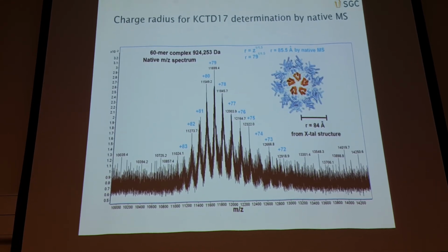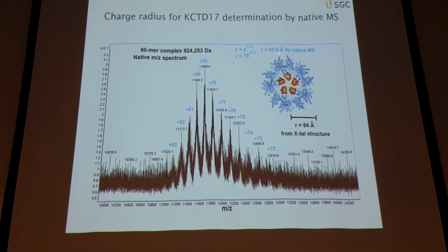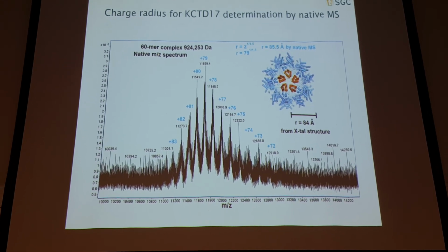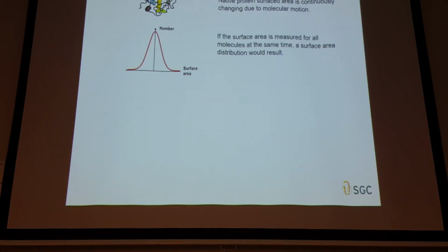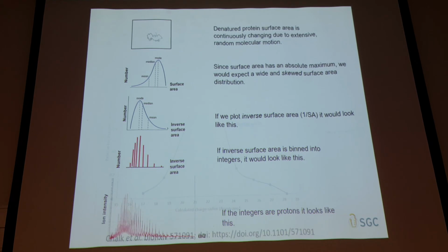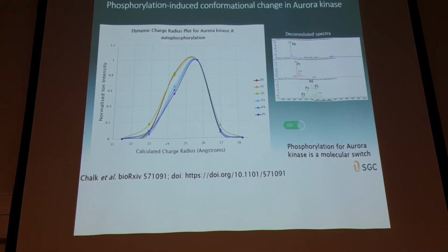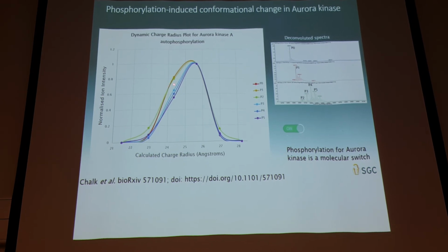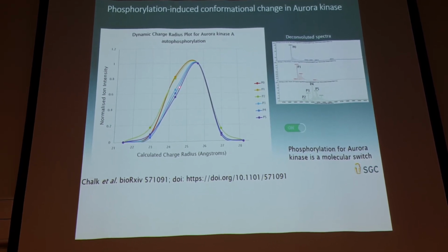Okay. Yes. So this is measurement of surface area. We can measure this. This is accurate to within 2%. Changes in conformation. Here. So this is the difference between these 3 distributions and these 3 distributions.